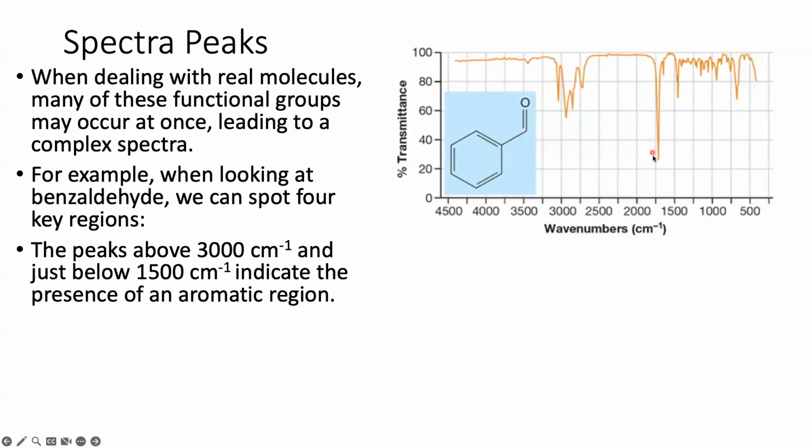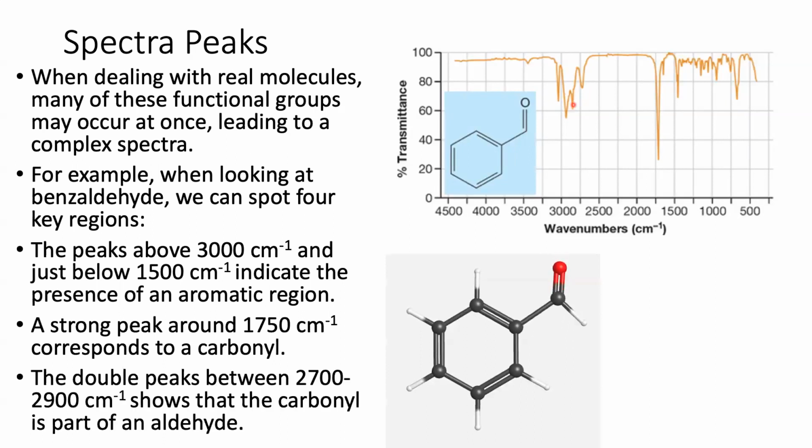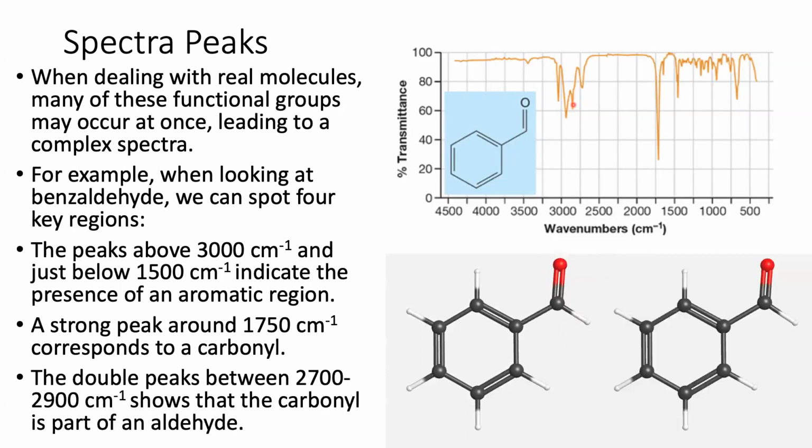Now, this leads to our other two major peaks. So I definitely have a carbonyl. That is a beautiful, strong peak around 1700. But what type of carbonyl? Well, I obviously don't have a carboxylic acid. I could have an ester. I could have a ketone. But the big thing here, look at those nice, pretty aldehyde fangs. That absorption around 2700 is a good indication, confirming the other tooth, an aldehyde fang. So in addition to this carbonyl vibration, I also have an aldehyde.